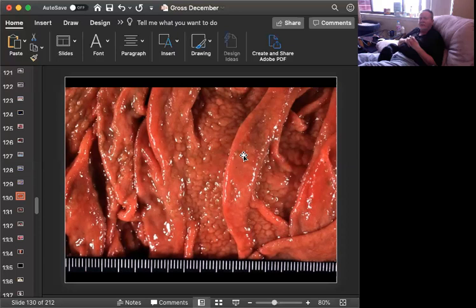My morphologic diagnosis on this is going to be a diffuse proliferative abomasitis. If you want to make a longer one, you could say diffuse abomasal mucosal epithelial hyperplasia and hypertrophy. And that's fine too. It says the same thing. What I don't want you to say is eosinophilic abomasitis, because these worms do not attach. The body doesn't really know what's there except it's sitting on the surface.